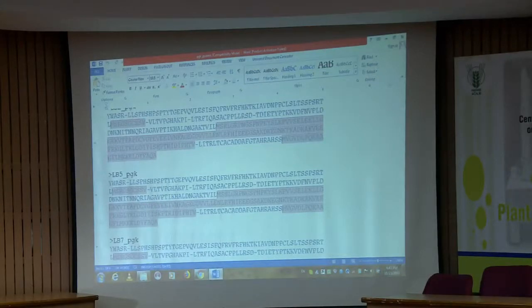Now, you have two things in your hand, one is the nucleotide file and another is this protein file. Now, we will start with how to make the flat file. For this thing, Sequin is one of the version that is in NCBI only. So, download that Sequin, that also you can use it later offline.